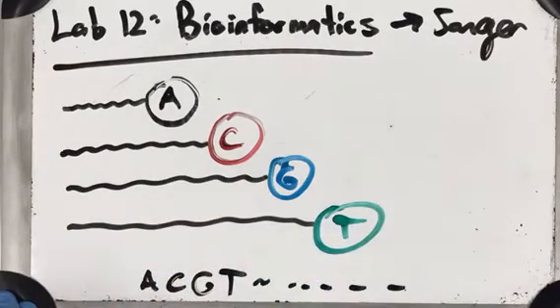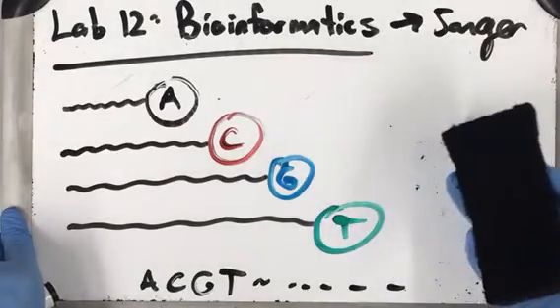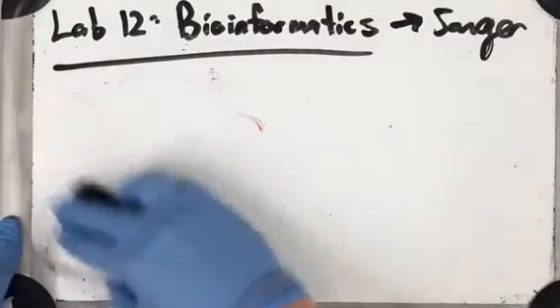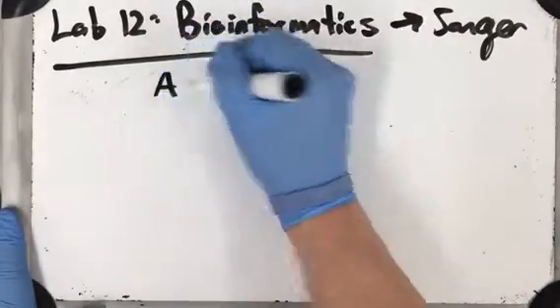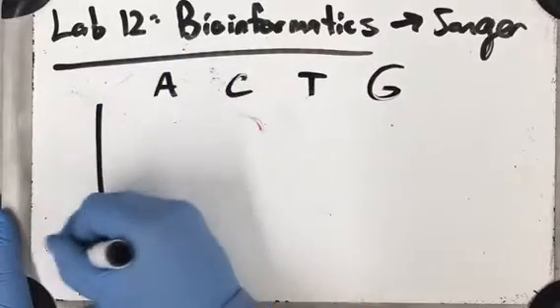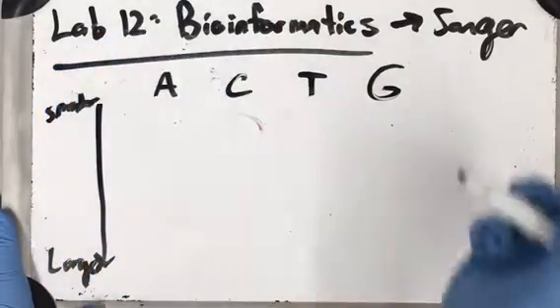It's because as you go longer, you can read those electropherograms. So definitely watch a video on this, like an animation. It'll do a lot better than I can at visualizing this. And the way you can measure the sizes and the fluorescence is, remember, you can do those gels. So the larger ones go down, the DNA smaller.